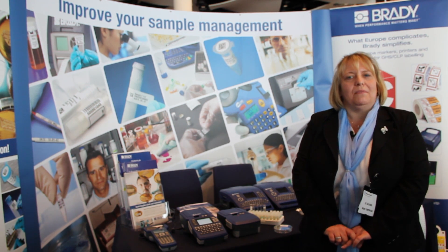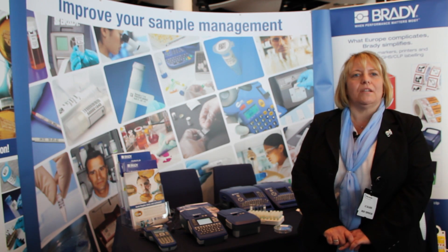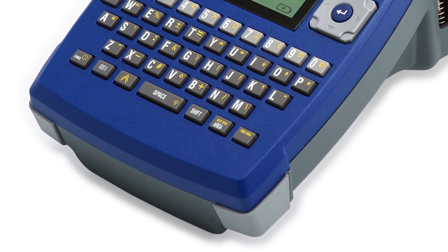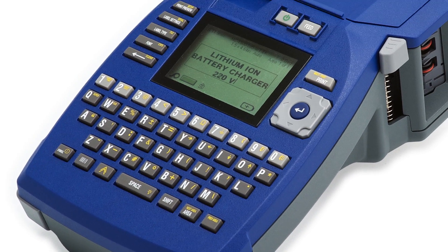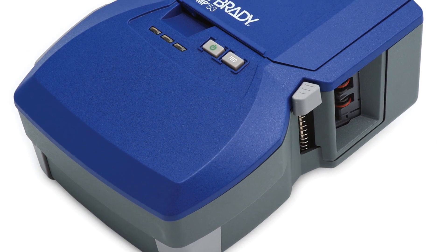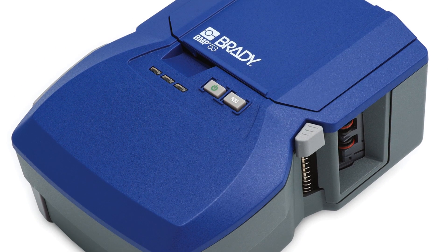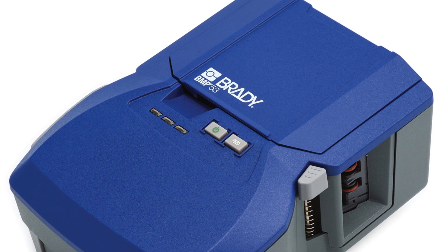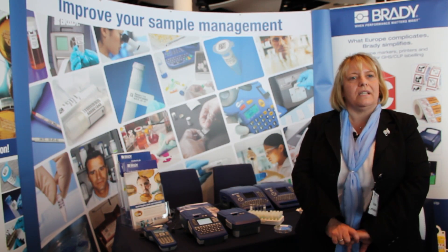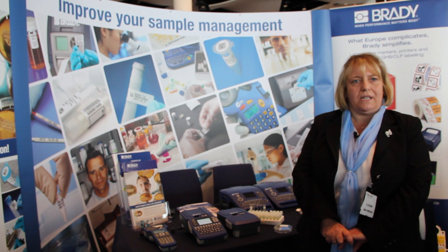Both printers are available to work with a free-of-charge downloadable software app for all Android phones. The BMP51 has a standalone keyboard and has all the range of labelling applications for the laboratory. The BMP53 has no keyboard and you can use it with a PC or an Android phone. The same labels go into each printer.